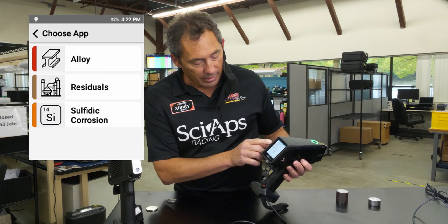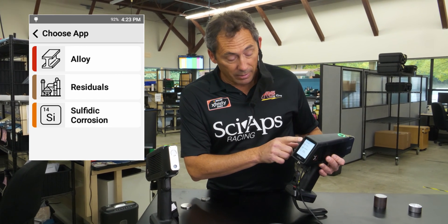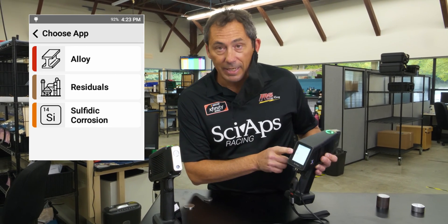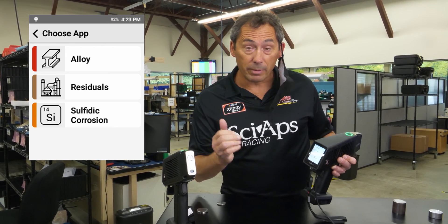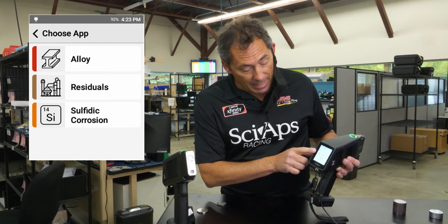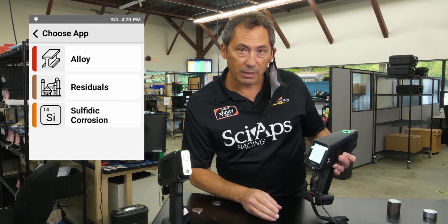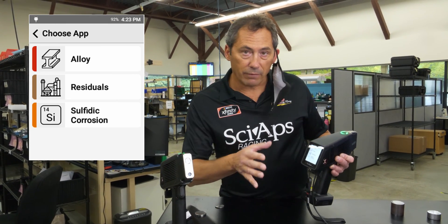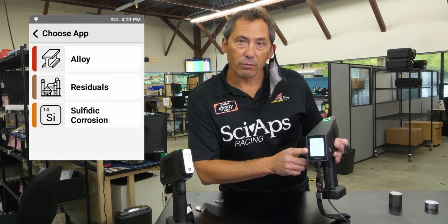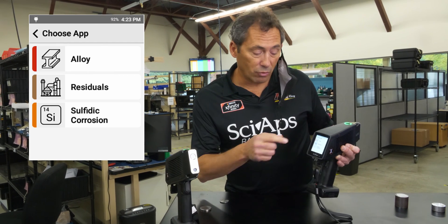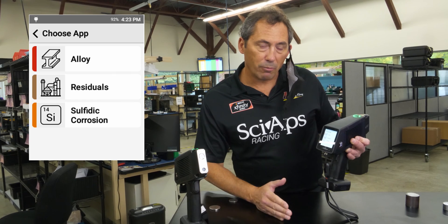When you hit analyze, you get a couple of choices. You get your general alloy testing, a big part of PMI, but the latest hot topic is residuals. We put a dedicated app on there to look at residuals, which is copper, chrome, nickel, niobium, and vanadium. The nice thing about that app is it dials in the calibration for those in steel and reports the sums, so you can make a very quick determination if you're above or below that 0.15% threshold value. Then finally, it's got a sulfitic corrosion app on there — same story, dialed in right on silicon and steels to know quickly if it's above or below 0.1% silicon.